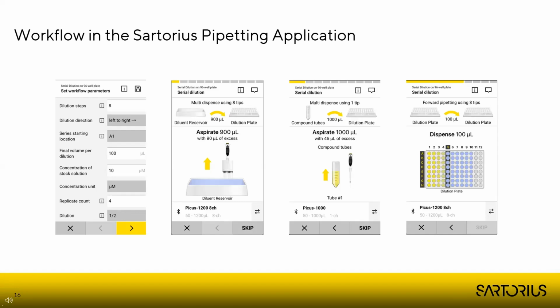Like we know that not every time you have exactly the same number of samples. So the number of samples might be a parameter that impacts how the workflow is run. So in the morning, we had 5 samples, and in the afternoon, we had 12. So the afternoon protocol is going to be much longer. There's more repetition.